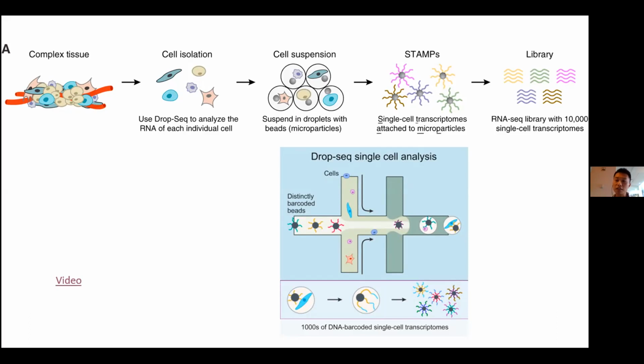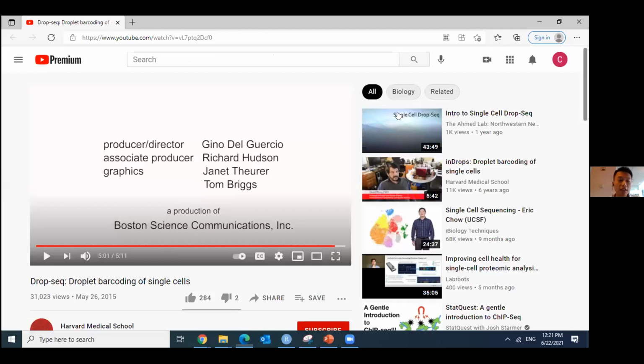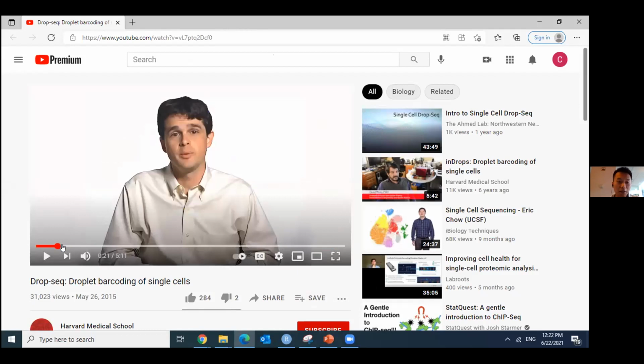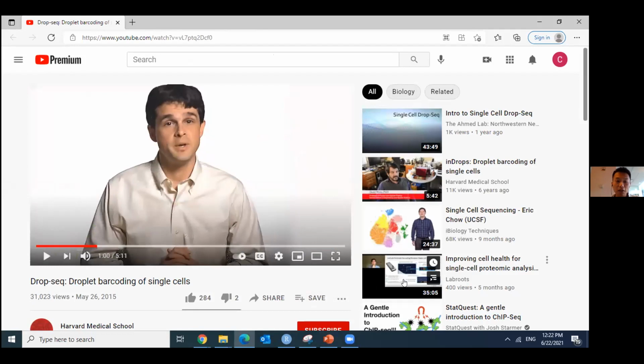Okay, so next we'll carry out a tutorial about how this data looks and how we actually analyze it, doing differential expression and this kind of clustering as you see in this video, and then how we identify the different functionalities. Okay. Any questions so far before going to your tutorial? I'll also flash back the video to see if we missed anything.